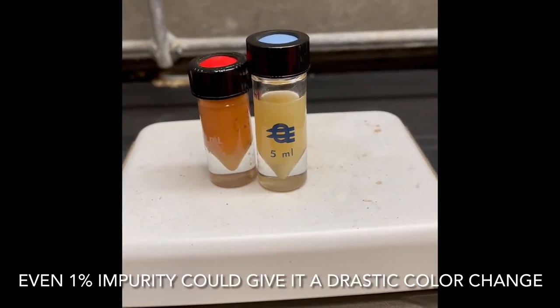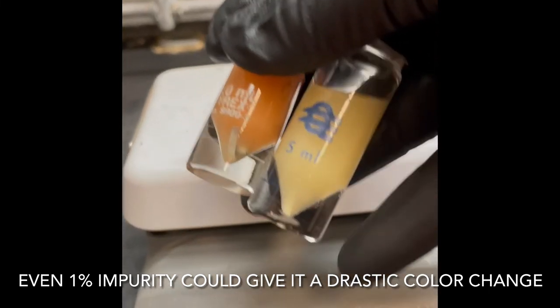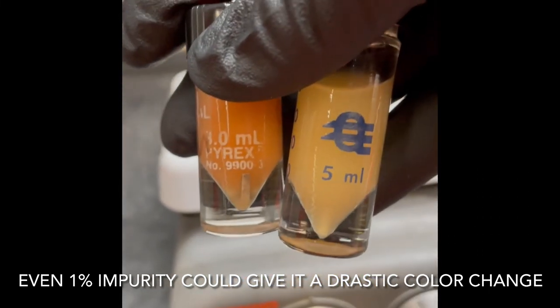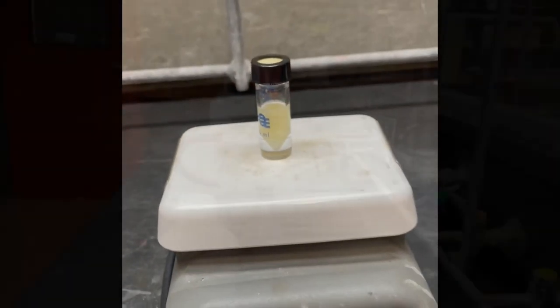What I'm going to do now is, I'm supposed to put it on ice, but I don't have ice, so I'm going to put it in the freezer for a little bit. Hopefully, there's some solid material in there, and we'll check it out and filter it later. Meanwhile, I got another one going.